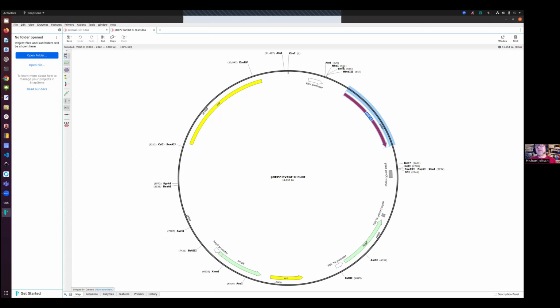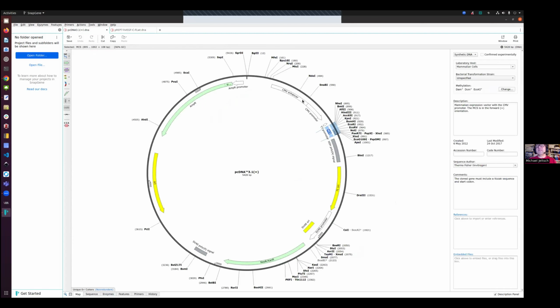And you can see here the restriction enzyme sites. If a restriction enzyme site is in bold, then it means it's only present once in the plasmid. These are the ones that you typically are interested in, the so-called single cutter enzymes. The only thing you have to do is check whether you find here one of the enzymes which you can also find in the multiple cloning site.